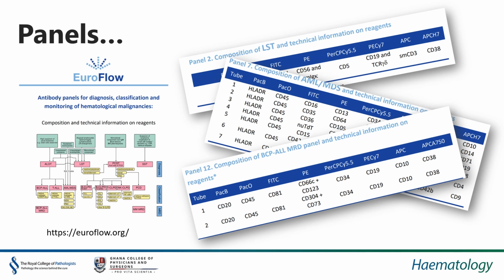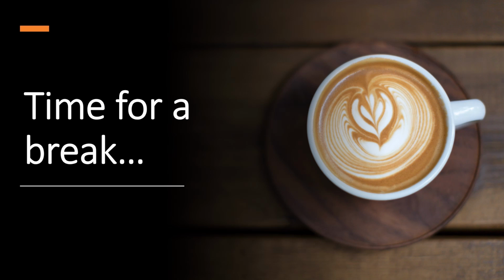So that covers the principles of flow cytometry in clinical practice. And we've covered antibodies, antigens, a little bit about gating strategies and what we're looking for, and how we can enumerate cellular populations and subdivide populations to actually tell us what these key cells are within a heterogeneous group.